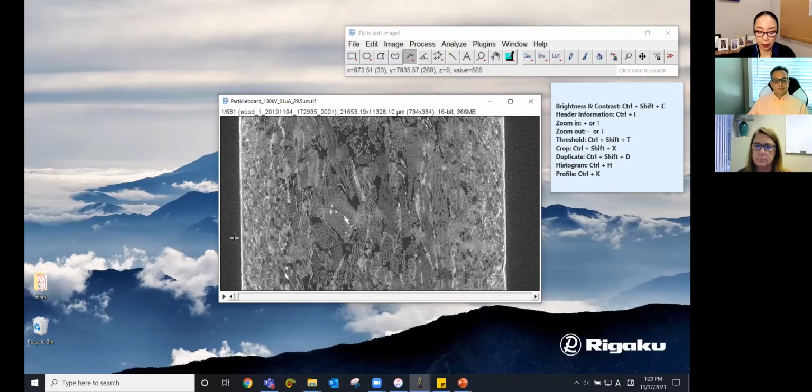And when you see something like this, it's probably interesting to analyze the packing density somewhere close to the surface for just one slice and do the same thing gradually, getting closer to the center. At the center, you probably see low packing density. But to do that, your slice needs to be parallel to the surface. The cross section, the slice we're looking at here, is perpendicular to the surface, so it's kind of inconvenient.